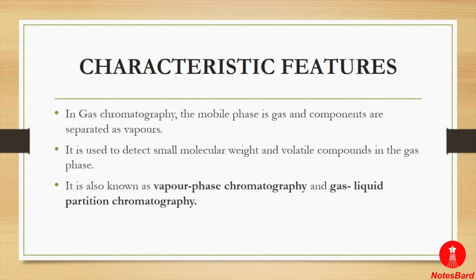It is also called vapor phase chromatography and gas liquid partition chromatography because it includes the gaseous phase as the mobile phase of the method.